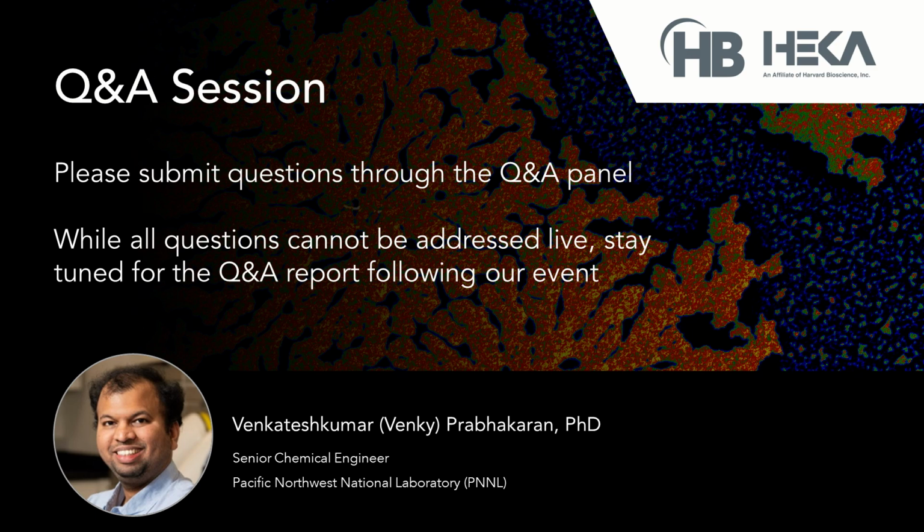Okay, yeah, I think it refers to that overall study. So far, in that research, we only tried a tantalum titanium oxide as a test case to demonstrate the platform. However, there is plenty of research going on to make a catalyst that is more active and produces less intermediate peroxide. And there is another strategy wherein a hydrogen peroxide scavenger has been implemented into the catalyst layer to minimize peroxide. But in our lab, we haven't tried anything on this using the SECCM platform yet. But as a fuel cell community itself, there is much research going on in that aspect.